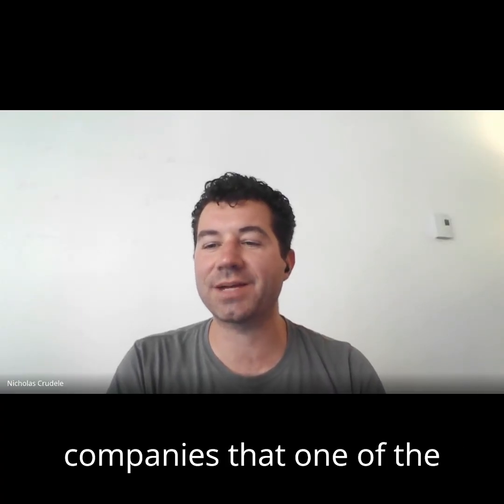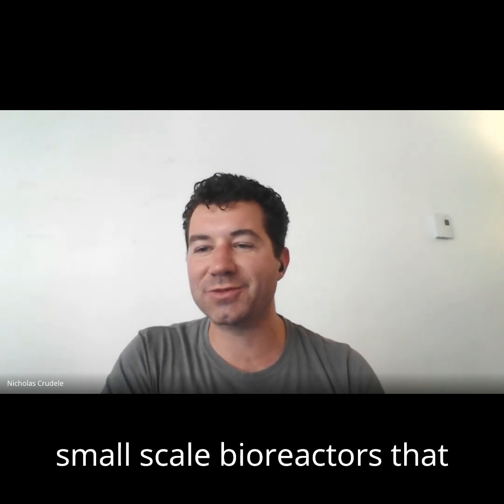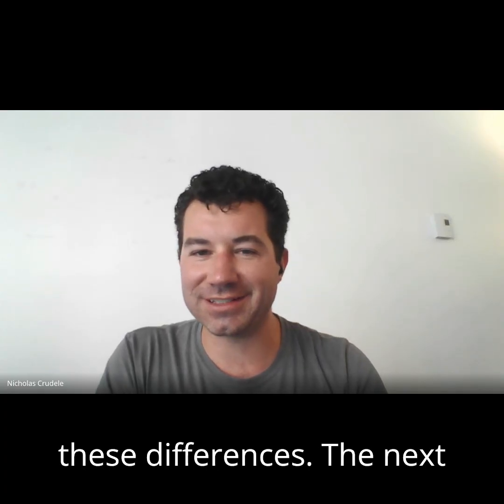Yeah, that makes a lot of sense. And I'm starting to see some emerging companies whose products are inserts for small scale bioreactors that aim to mimic these differences.